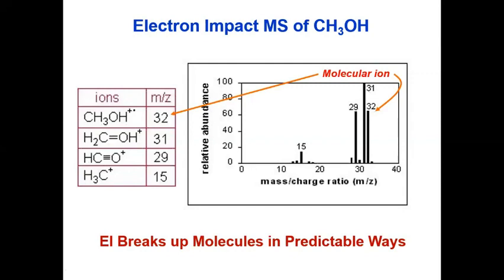What is the significance of the base peak in the mass spectrum? It shows the abundance, meaning more of this fragmented ion is formed, or the stability of this fragmented ion is higher. Then we have the peak at 15, the possibility of fragmentation to a CH3 cation in the mass spectrum.